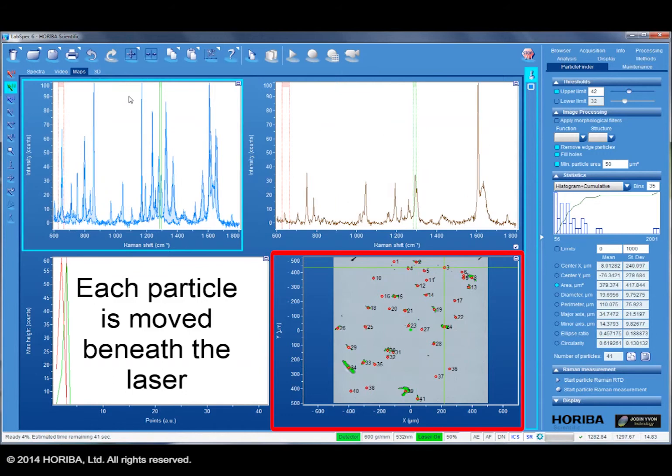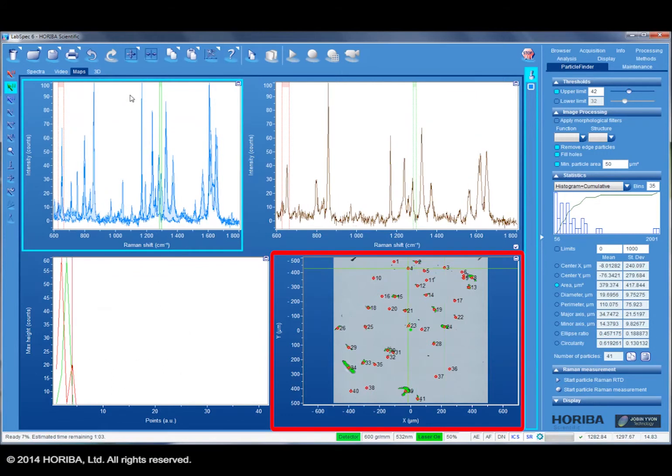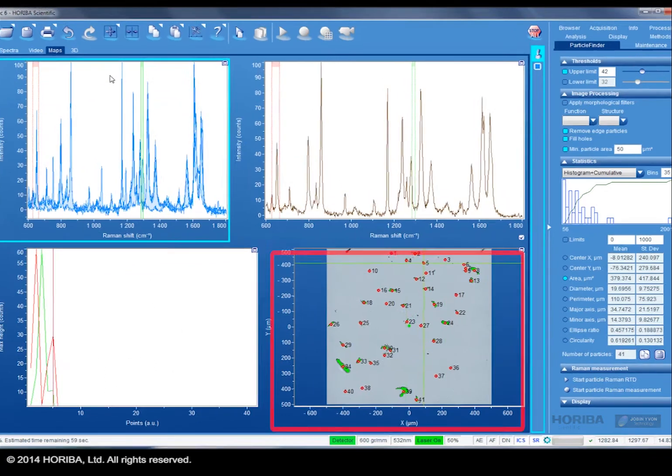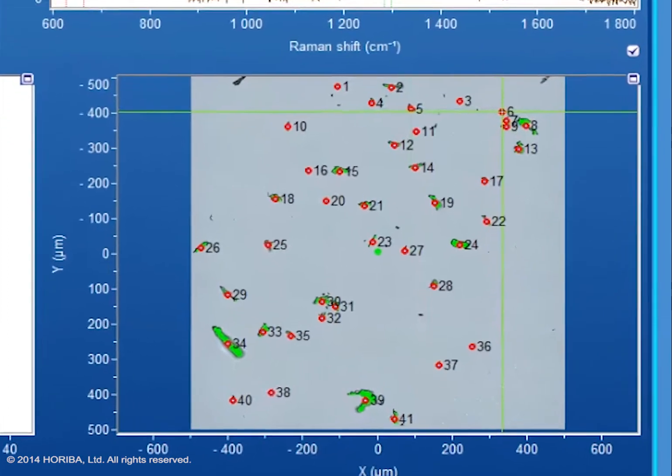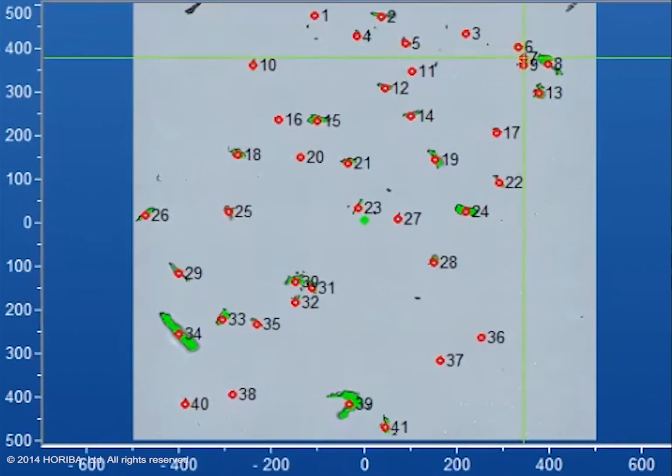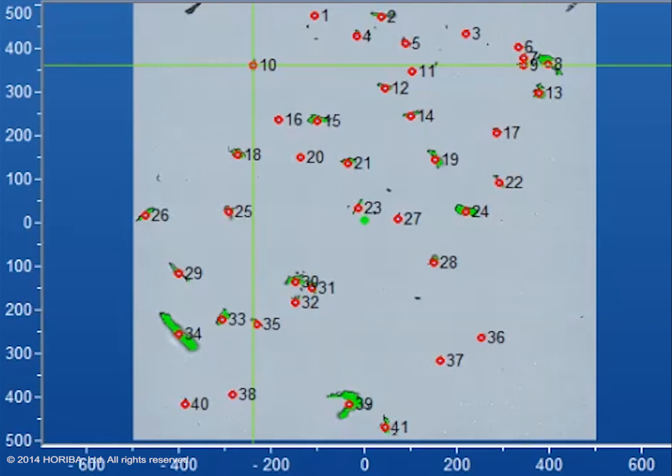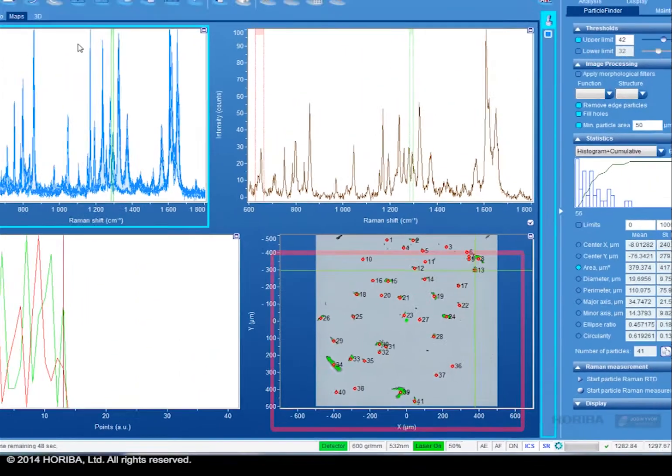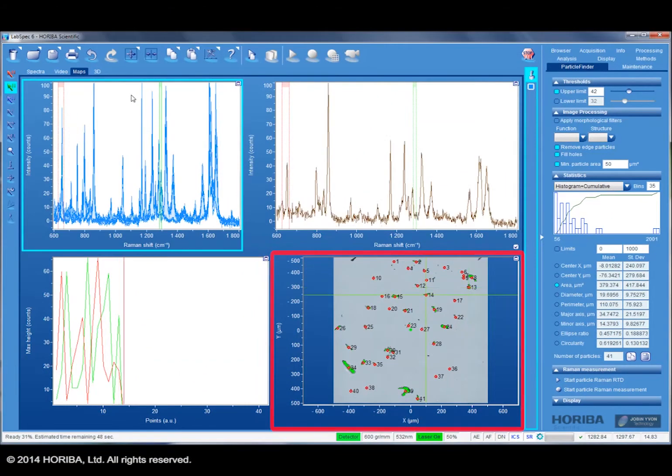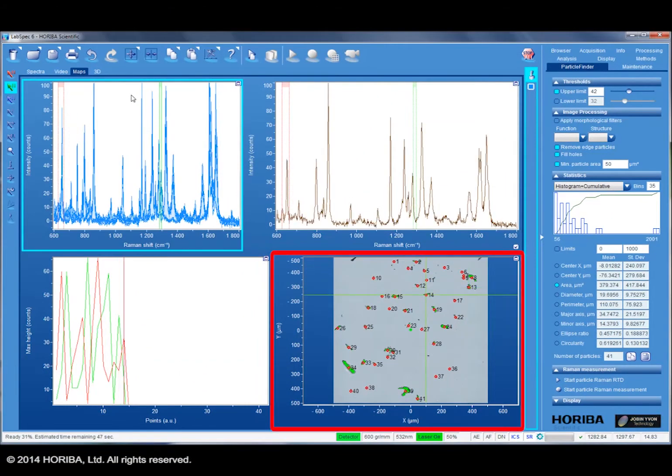The software acquires the spectrum according to the experiment settings. In this case, the laser wavelength is 532nm, acquired with a 600 groove grating on the LabRAM HR Evolution system, providing a spectral resolution of approximately two wavenumbers. The acquisition time per particle is just 500 milliseconds.